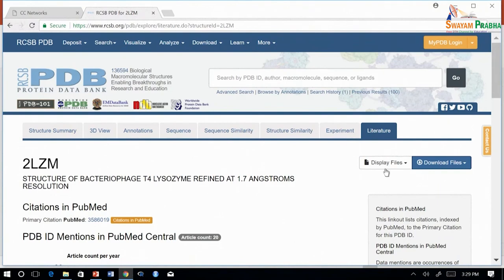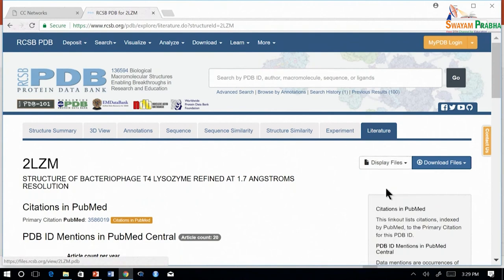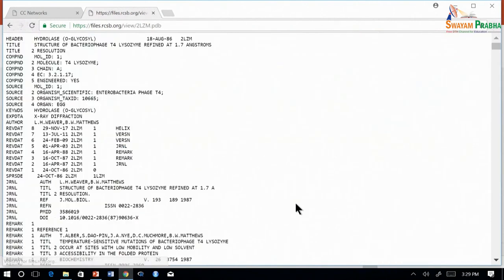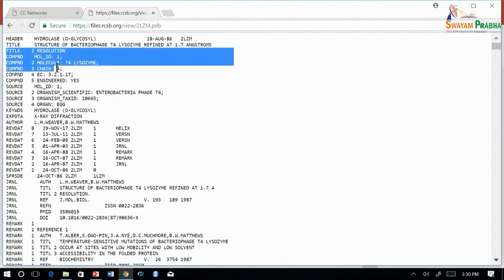Now, how to view the PDB file? If you click here, this display file, you can see the PDB file. Here we have the header information. This gives the title, the date it was deposited, and it also gives the compound details.